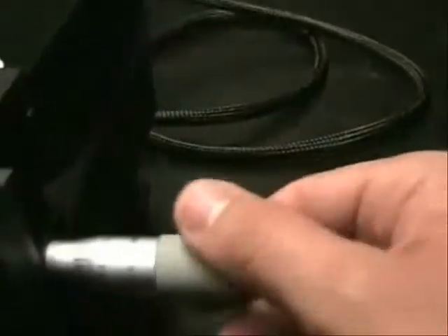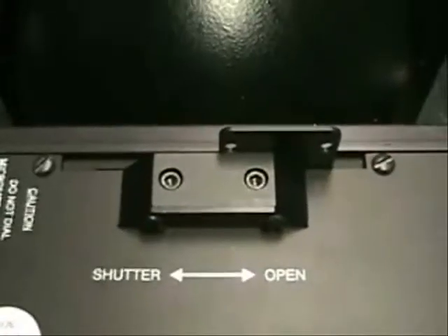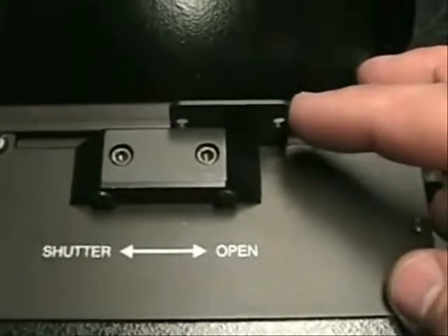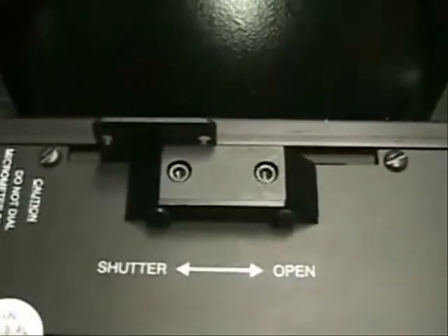The light levels are set by turning this micrometer. Turning it counterclockwise will increase the intensity, and turning it clockwise will decrease the intensity. Once you get the intensity set to the way you want it, you can control the light entering into your sphere by this shutter. There are two positions — the current position is open. To close it, simply slide to the closed position.